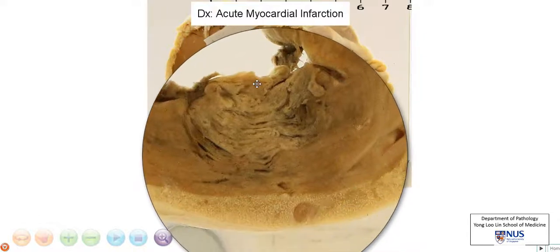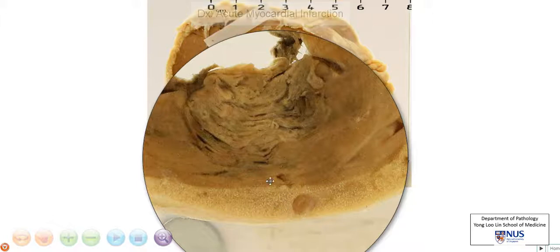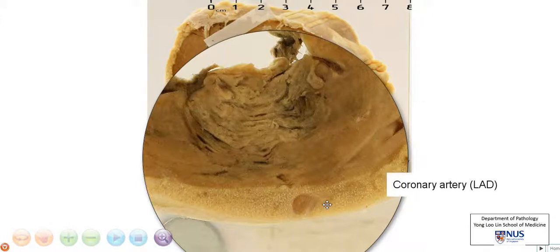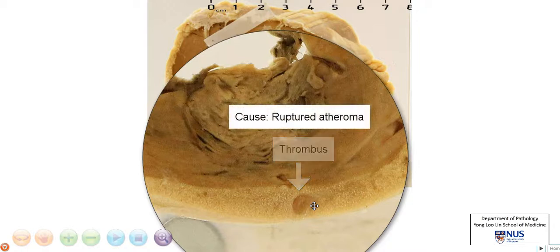Now let's look closely and see whether we can find the cause. If you look in the pericardial fat here, there is a vessel that has been cut transversely. This is the left anterior descending coronary artery. One of the commonest causes of myocardial infarction is occlusion of the coronary arteries. This coronary artery is actually occluded by a thrombus, and the cause of the thrombosis is usually that of a ruptured atheromatous plaque.